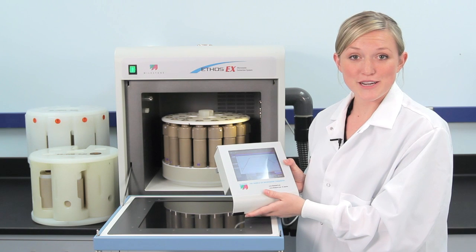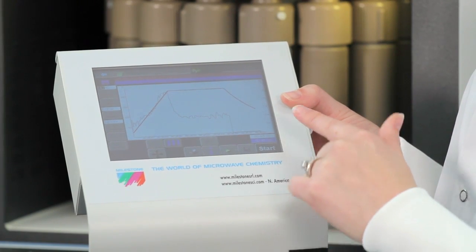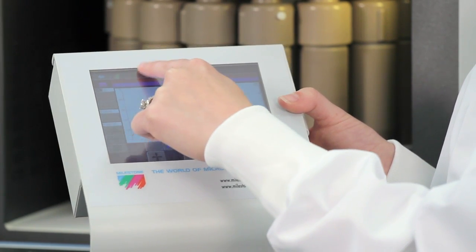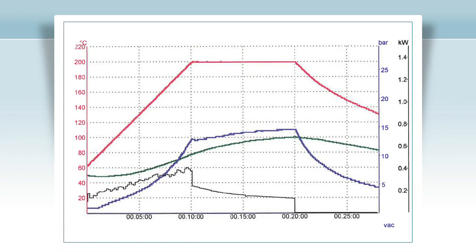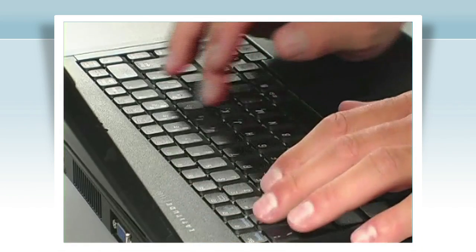Create a new program or simply recall a stored program and press start. When the microwave program is in progress, a real-time display showing actual temperature and power applied is shown. Another great feature of Easy Control software is it automatically adjusts the power depending on how many samples are in the run. When the run is complete, it can be stored and recalled at any time.